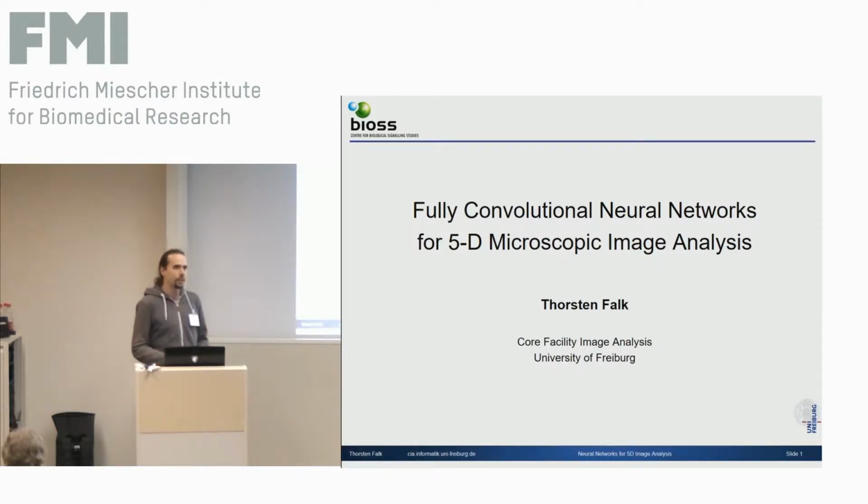So this talk will be mainly, I'm working in a research lab, so it is really not like a core facility, so it will not be so much about big data management. It will be more about having a nice framework of processing data quite fast, because image processing seems to be a bottleneck, obviously, from the last talks we saw. And I want to show you one approach, deep learning, which is quite fast and which hopefully makes it a little better so that we can process our data at a speed that is reasonable and comparable maybe to the recording speed.